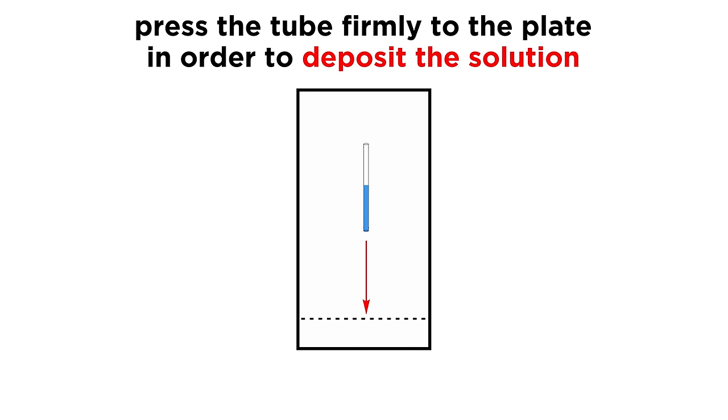We will then spot the plate with the contents of the tube. To do this, press the bottom of the tube to the plate, right on the line we drew, firmly enough that the solution gets deposited onto the plate, but not so firmly so as to disrupt the silica. Spot two or three times to load most of it on there.